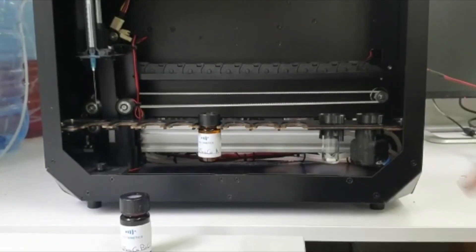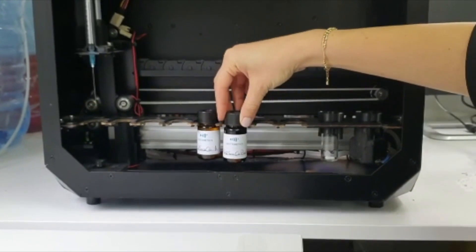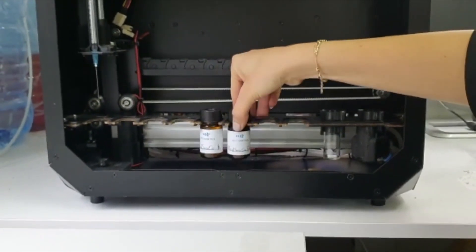Now you can place the prepared reagent in its assigned position in the reef boat.